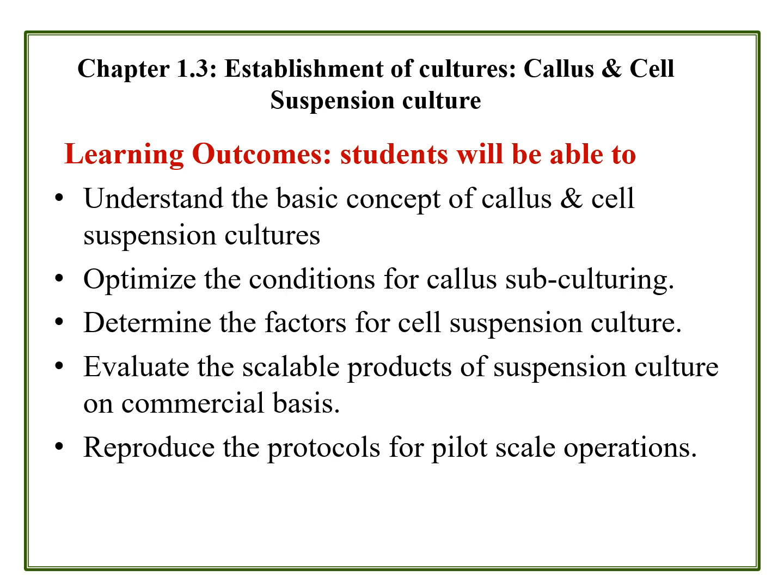Here, the callus is an unorganized mass of cells obtained in in vitro conditions. Cell suspension cultures are usually obtained through liquid cultures where the agar is not added, and they will be able to optimize the conditions for callus subculturing.